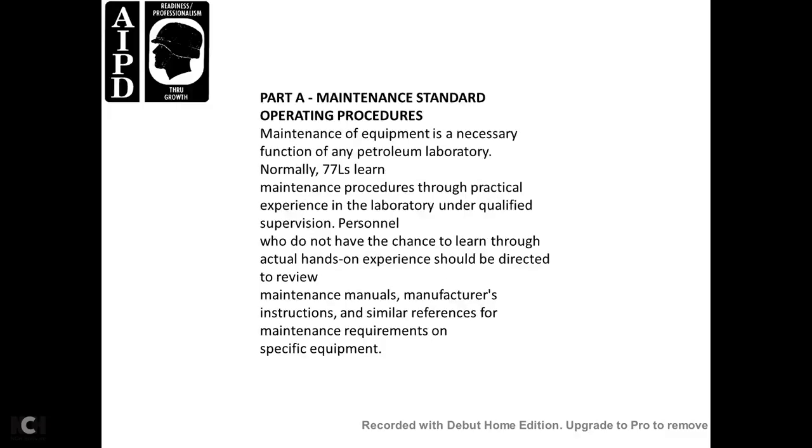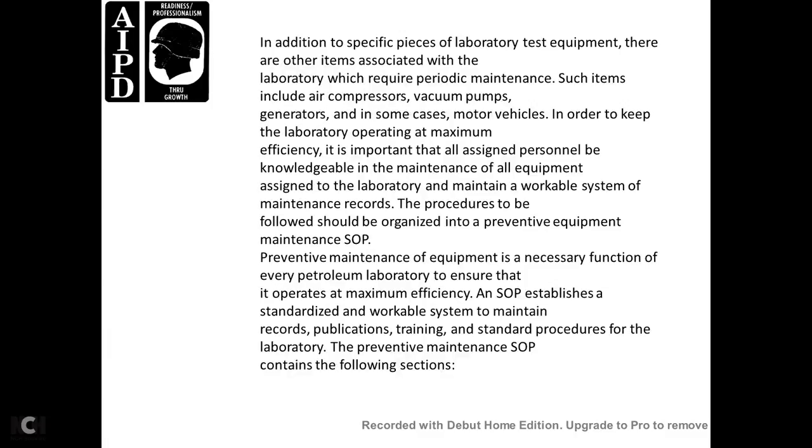Part A, Maintenance and Standard Operating Procedure. Maintenance of the equipment is a necessary function within the Petroleum Laboratory. Normally, the 77LS learns maintenance procedures through practical experience in the laboratory under qualified supervisory personnel. Those who do not have a chance to learn through actual hands-on experience should be directed to review the maintenance manuals, manufacturer's instructions, and similar references for the maintenance requirements of the specific equipment. In addition, besides specified pieces of laboratory test equipment, there are other associated items requiring periodic maintenance, such as the air compressor, vacuum pumps, generators, and in some cases motor vehicles, in order to keep the laboratory operating at maximum efficiency.